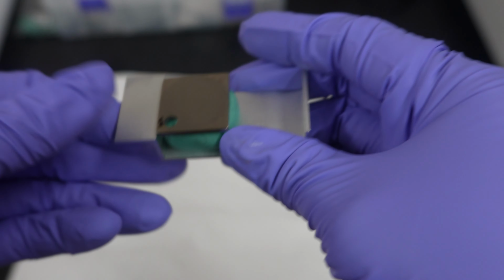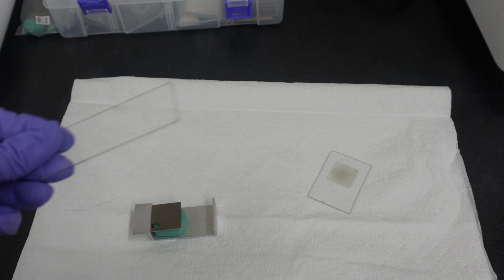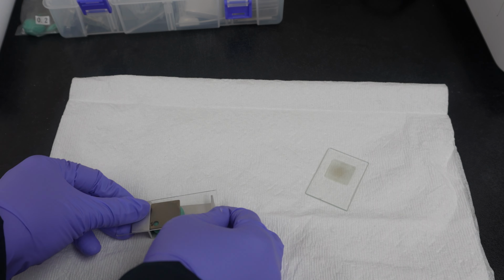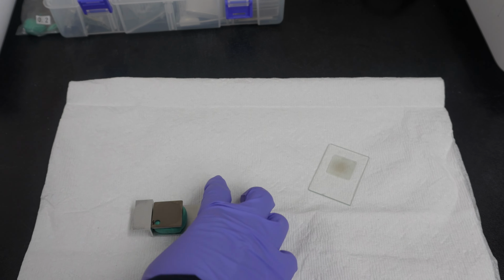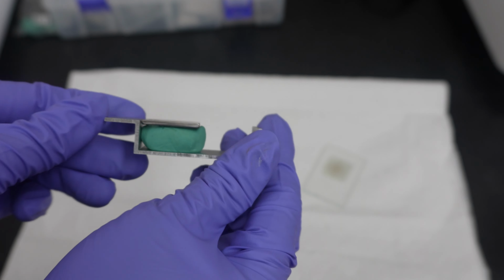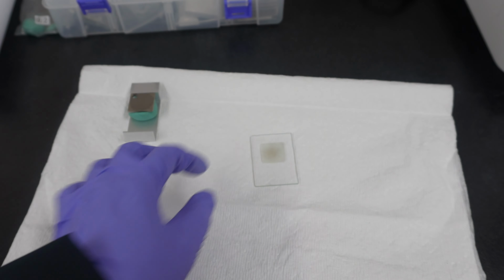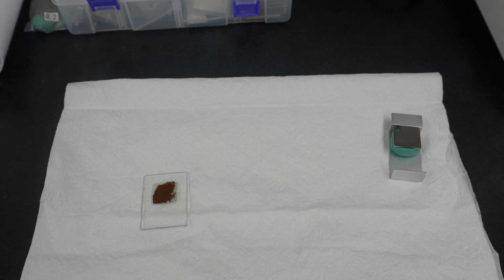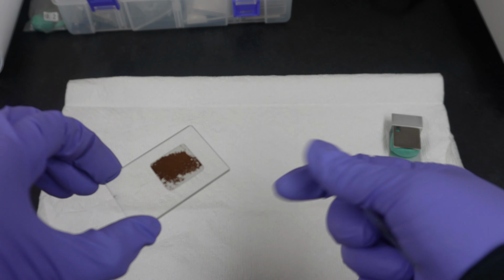And to make sure this one is flat, you can use a glass like this, and then tap on top of it until it becomes flat. For the second sample, the powder, you prepare the sample on top of it. So the second sample is here, the powder.